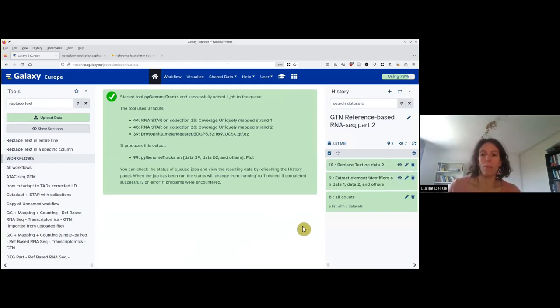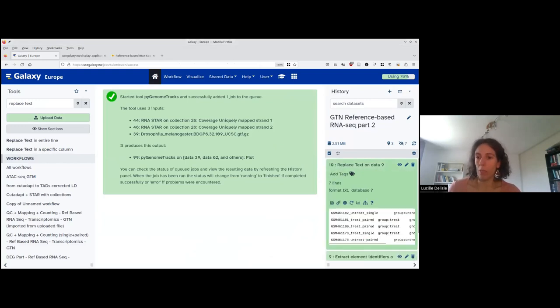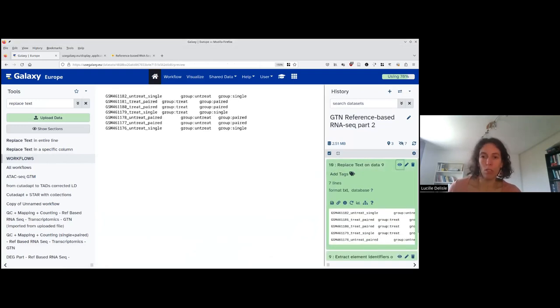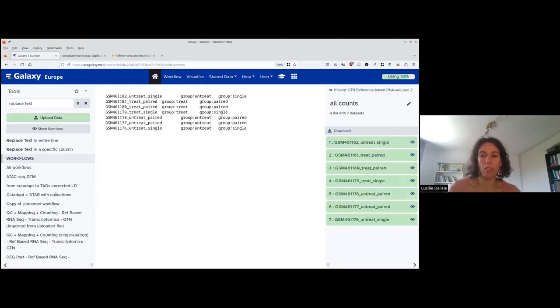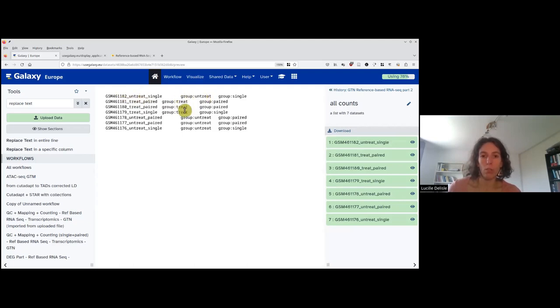This step may appear a bit obscure, so we will check the outputs. We can see that now we have the name that matches the identifiers in 'all counts,' and then we have 'group,' and we extracted the second part: untreated, treated, treated, treated, untreated, and then single, paired, single, etc.